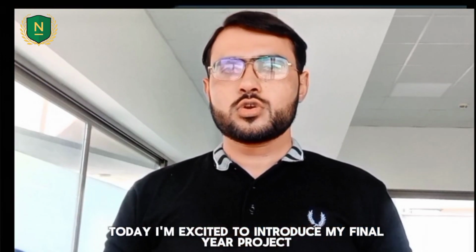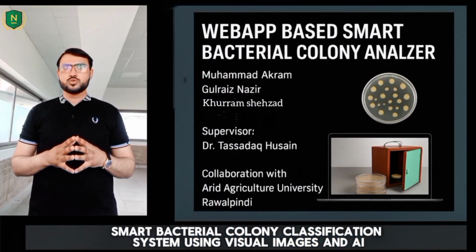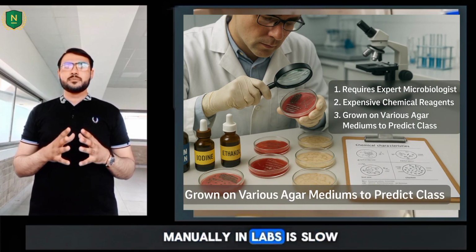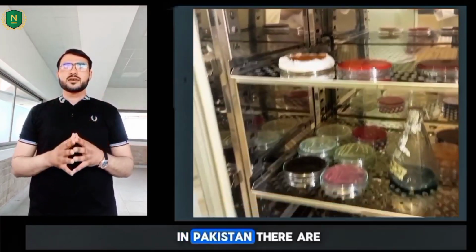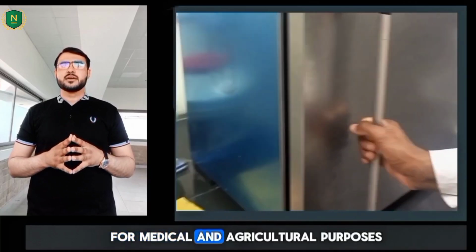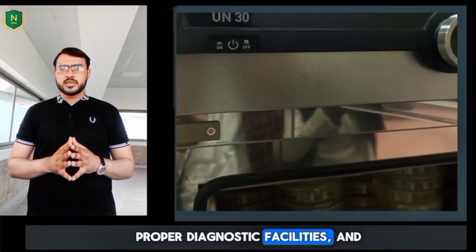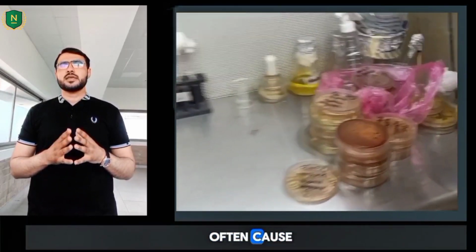Today, I am excited to introduce my final year project, Smart Bacterial Colony Classification System using visual images and artificial intelligence. As we all know, identifying bacterial colonies manually in labs is a slow, expensive, and error-prone process. In Pakistan, there are around 469 licensed microbial labs for medical and agricultural purposes. However, many remote areas in Pakistan still lack proper diagnostic facilities, and sending samples to major cities like Lahore and Islamabad often causes delay in treatment.